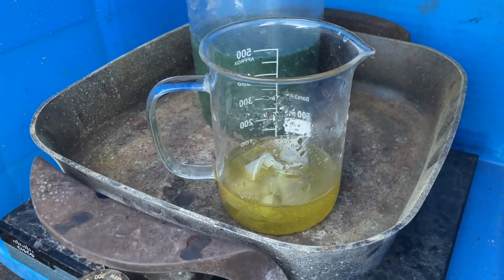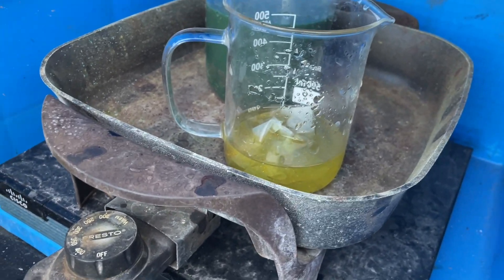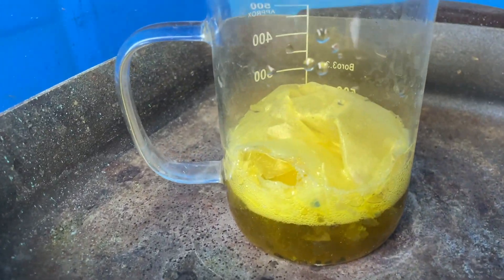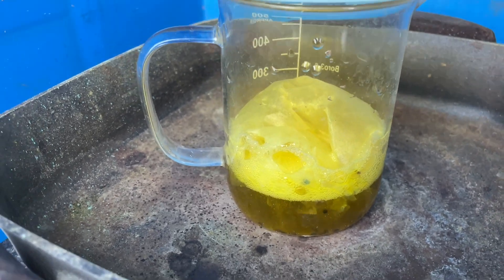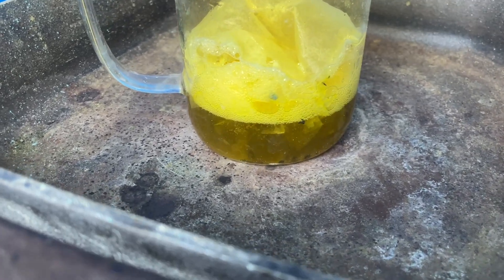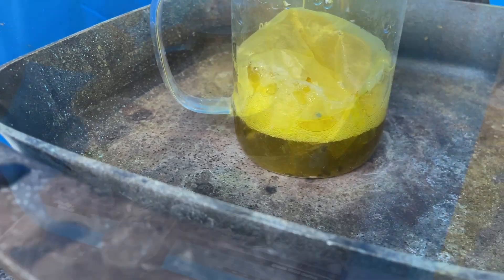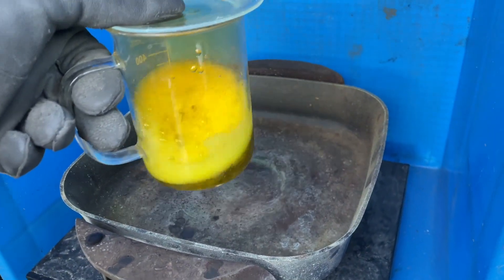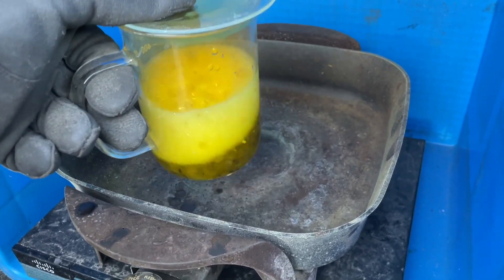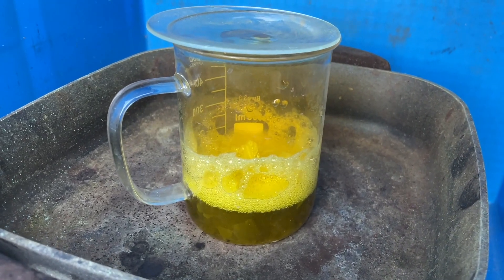We'll bring it up to a boil a little bit, make sure we got everything in solution, then filter it, check it for any nitric, and drop the gold. It's starting to foam up — yeah, it's got a nice head on it. You can see how yellow that liquid is getting — yeah, it's putting that gold into solution.